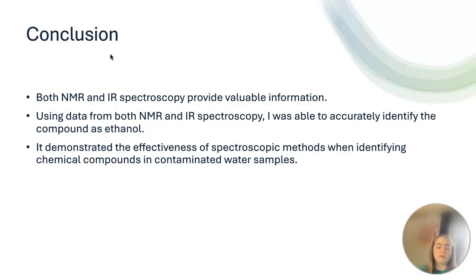In conclusion, this experiment provided valuable information about NMR and IR spectroscopy. I was able to identify my unknown compound, which was ethanol, and it demonstrated the effectiveness of spectroscopic techniques when identifying compounds, even if they're unknown, in contaminated water samples.